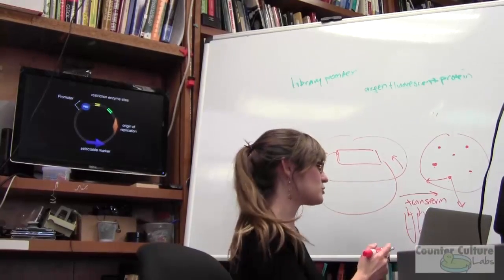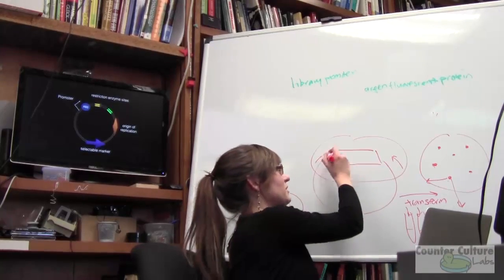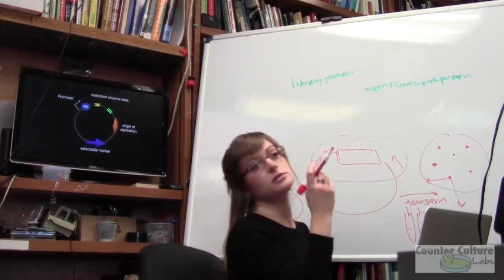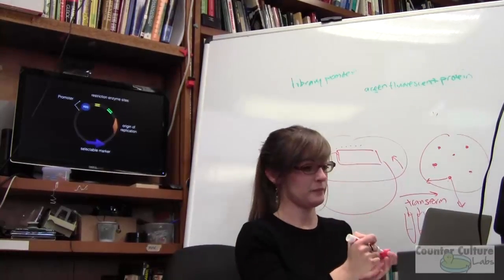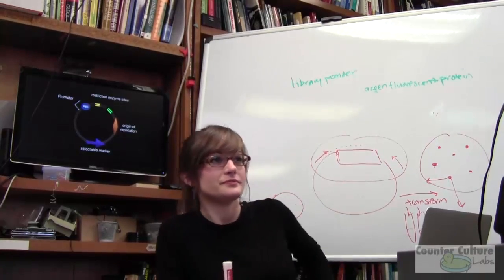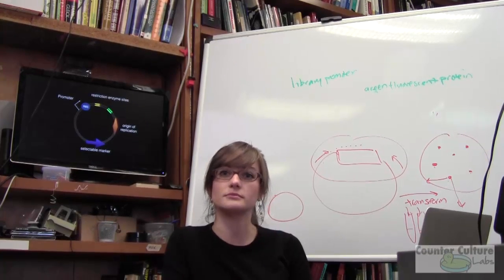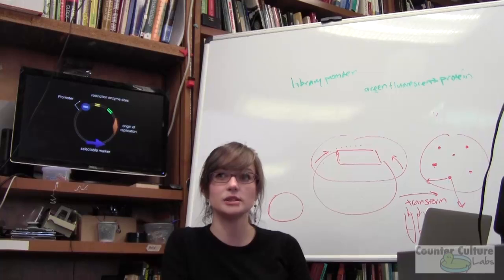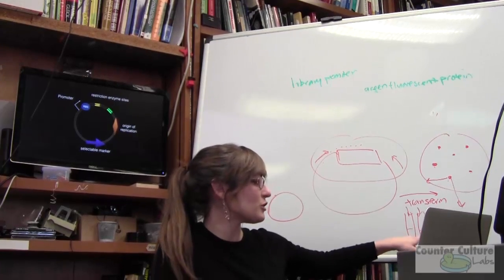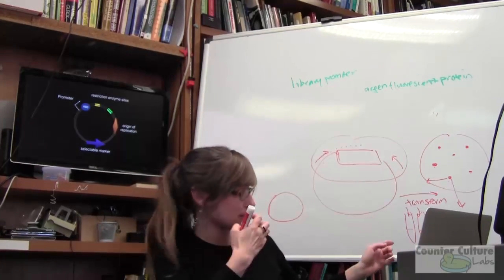And then you get a plasmid. So then you could send that vector for that plasmid for sequencing, like with a primer that bound here. So if your DNA synthesis company gives you a vector with your sequence on there, that's a tiny, tiny amount. At this point, you've really amplified it up, and you have massive amounts of that little plasmid that you can now store for later use. Exactly. Right? And you can save this and do whatever you want with it. And the clone that works, you can keep on retransforming and make more and more of it if you need to.